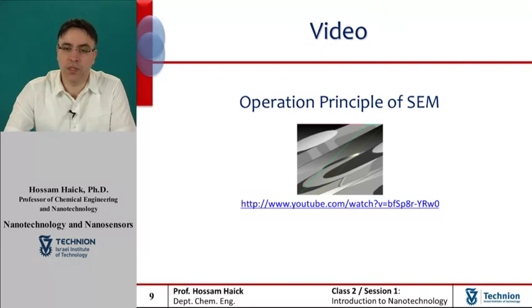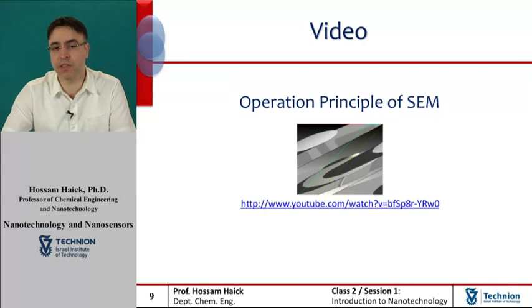Following is a short video that demonstrates the SEM operation along with an animated presentation. Please have a look and try to connect the parts described in the previous slide with the shown parts in the animated video. Enjoy.